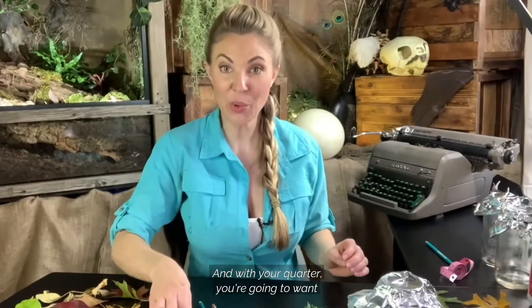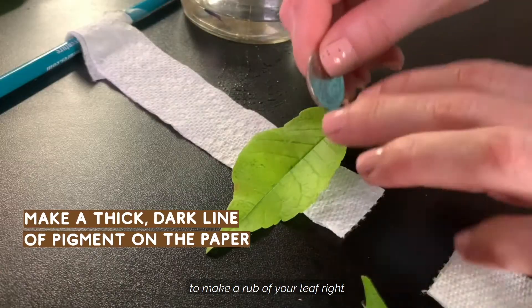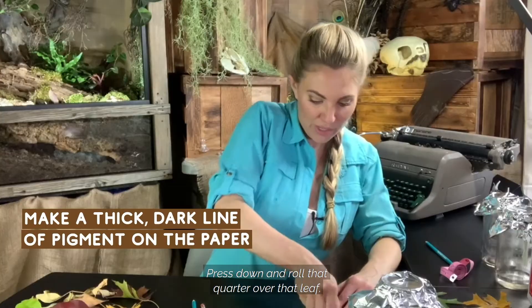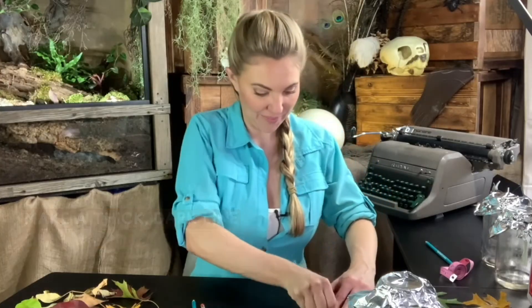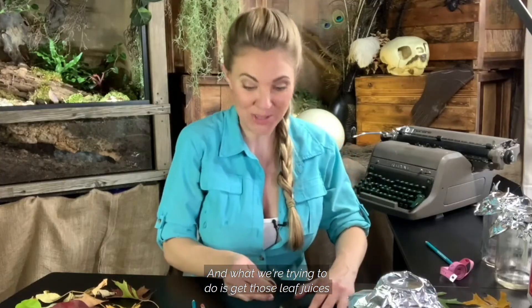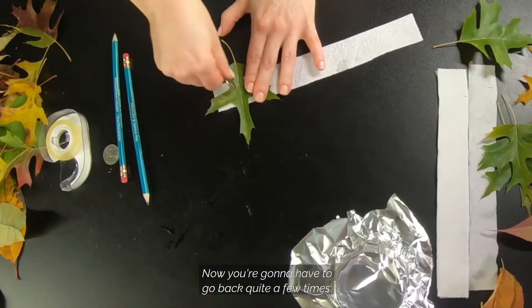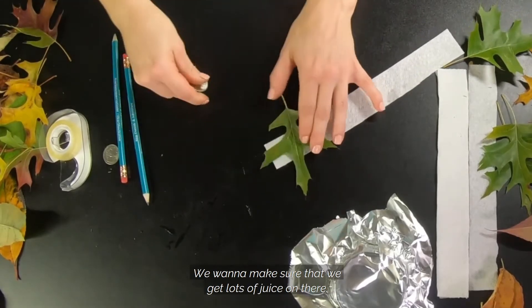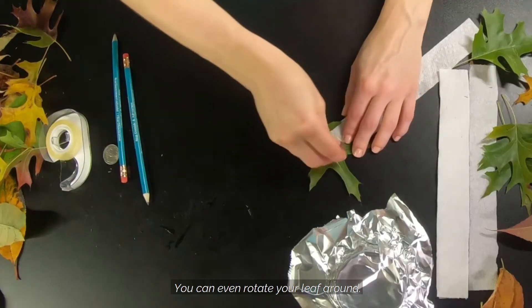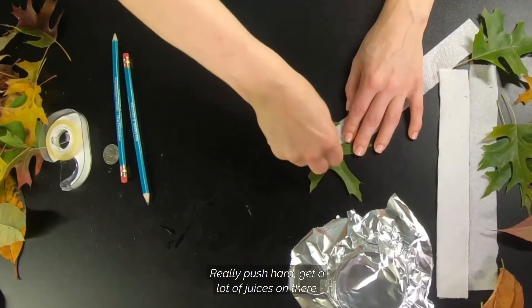With your quarter, make a rub of your leaf right where that one inch mark was. Press down and roll that quarter over that leaf. What we're trying to do is get those leaf juices onto our paper towel. You're going to have to go back quite a few times — we want to make sure we get lots of juice on there. You can even rotate your leaf; really push hard and get a lot of juices on there.